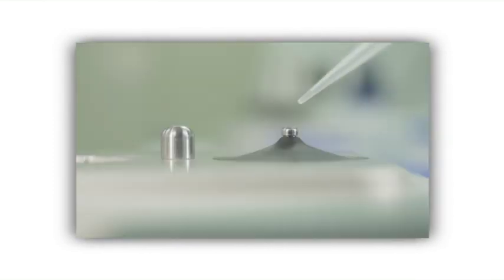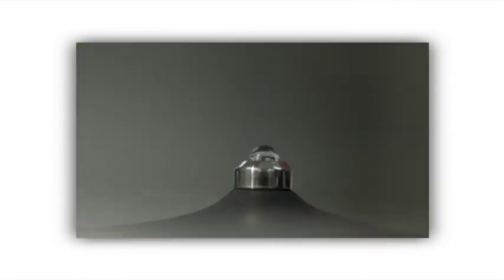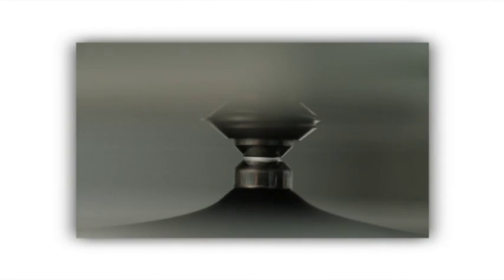As little as one microliter of sample is pipetted directly on top of the lower optical surface. Upon closing the spectrometer arm, a liquid column is created between the upper and lower optical pedestals by surface tension, forming a vertical optical path.